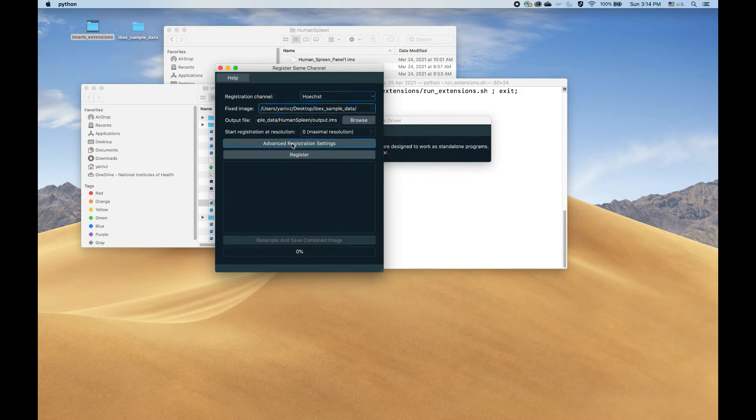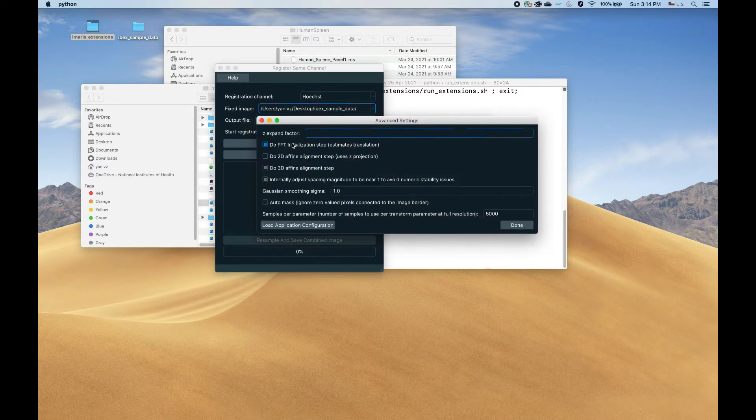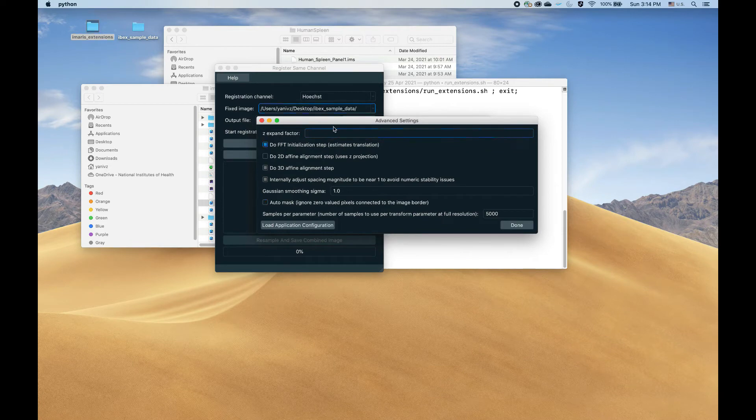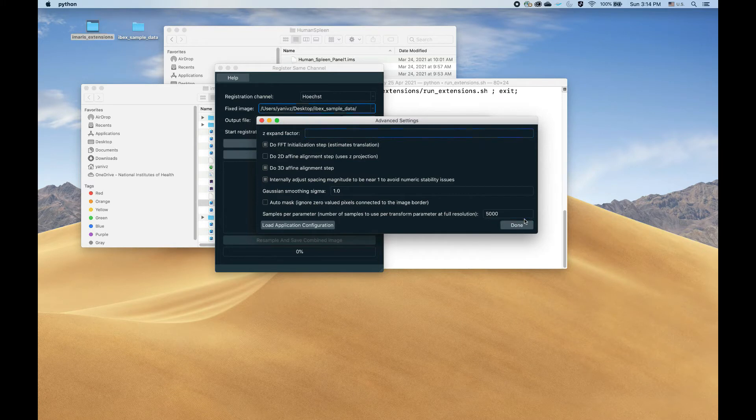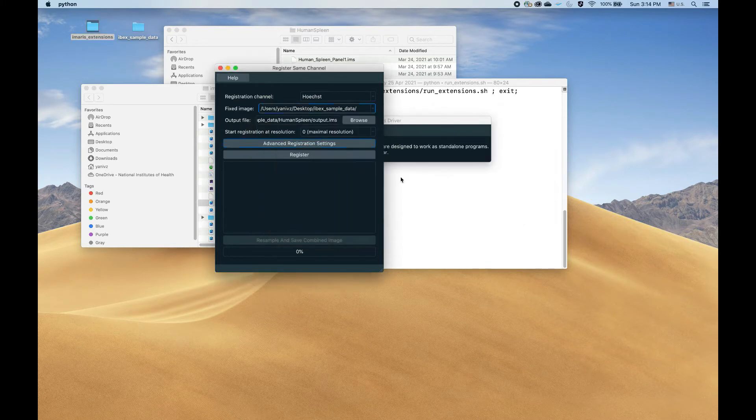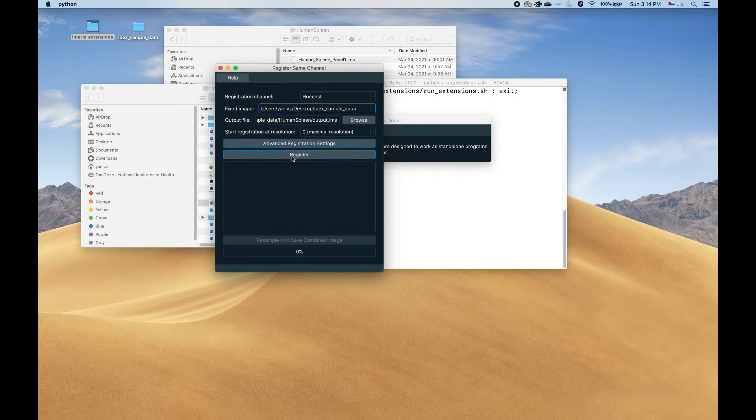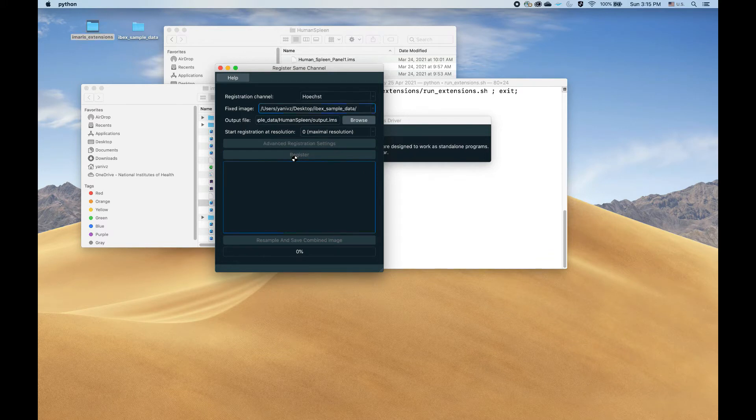If you encounter failure modes, you will have to go into the advanced registration settings, modify some things here based on the help, or if you're just curious, play with things here and see how they affect the registration. So without further ado, the next thing is just press the register button, and in a second the registration itself will start.